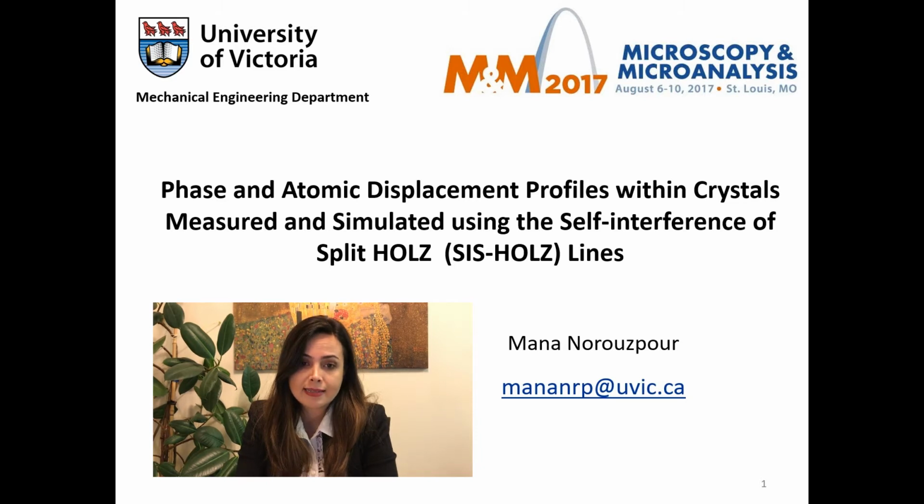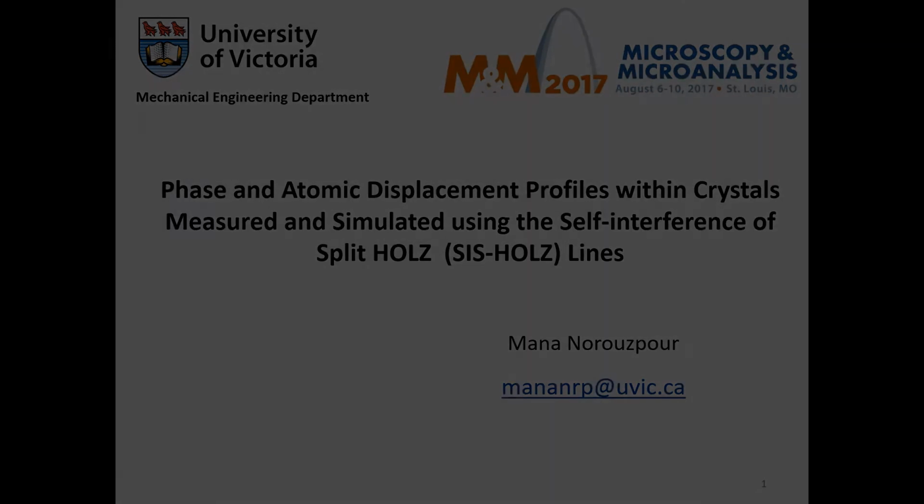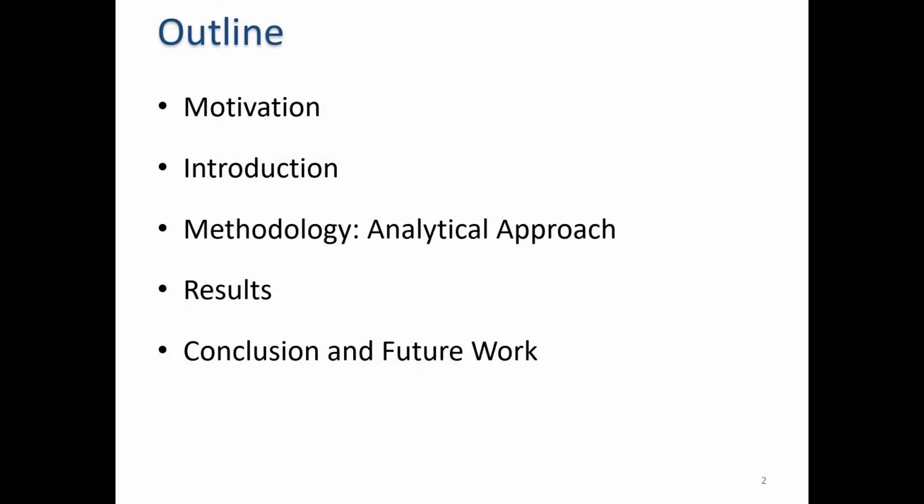My presentation is about reconstructing the phase and the atomic displacement profile through the specimen thickness using self-interference of a split HOLZ. First, I would like to start with the motivation of this work, which is followed by introduction. Then I will present the methodology, which is the analytical approach of the work. The experimental procedure is already presented in details in my published papers. I will show you the references and shortly review the experimental setup. Finally, I will wrap it up with some results, conclusion, and future work.